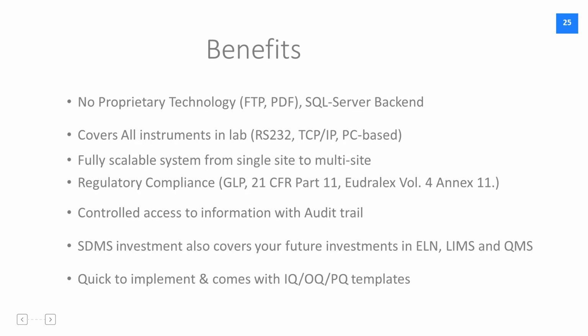The system is fully scalable from a simple startup laboratory, single site laboratory to multi-site enterprise laboratories. And the system will help you in regulatory compliance with respect to good laboratory practice, 21 CFR Part 11, Eudralex Annex 11.